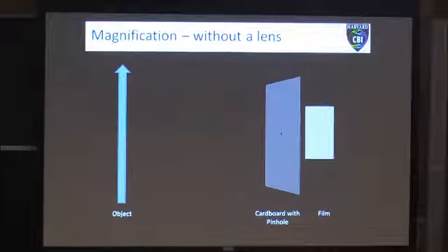Let's just have it as an arrow. But you can think of it even as just one person standing in the middle of this room. Right? That object or the person standing in the middle of the room, they aren't a luminous object. They're not creating light, right? They're not a light bulb or anything like that. So where's the light coming from? Everywhere, right?